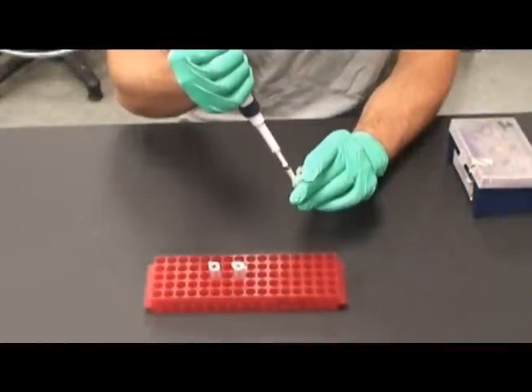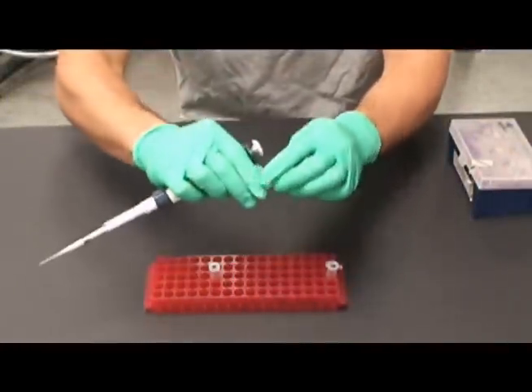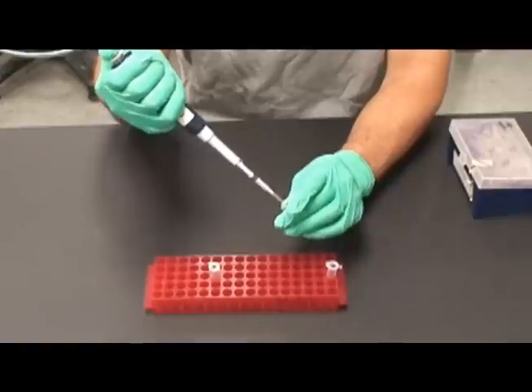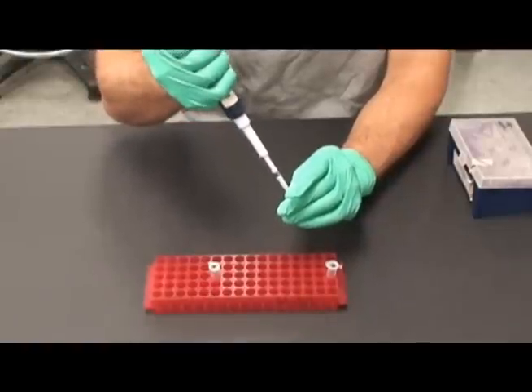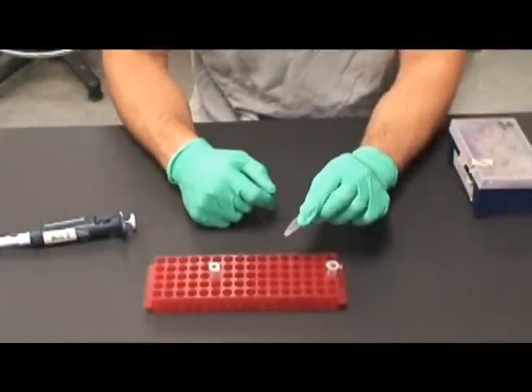Add 5 microliters of the plasmid DNA to one of the competent cell tubes. To transfer such a small amount, make sure to submerge the pipette tip into the liquid before expelling the contents of the tip. Label this tube plasmid DNA.